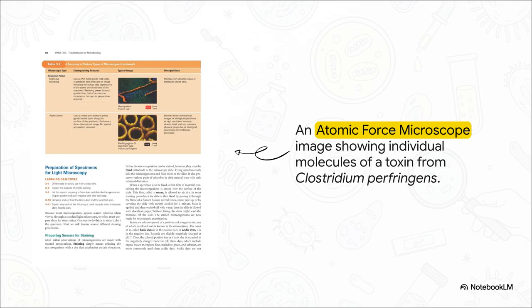This image comes from an atomic force microscope, or AFM. It doesn't use light, it doesn't use electrons. Instead, it works by literally feeling the surface of a specimen with an unimaginably tiny probe, building an image atom by atom. What you are looking at right there are the individual molecules of a toxin that's made by bacteria. We've literally journeyed from seeing blurry shapes in a drop of water to visualizing the actual molecular machines of life itself.